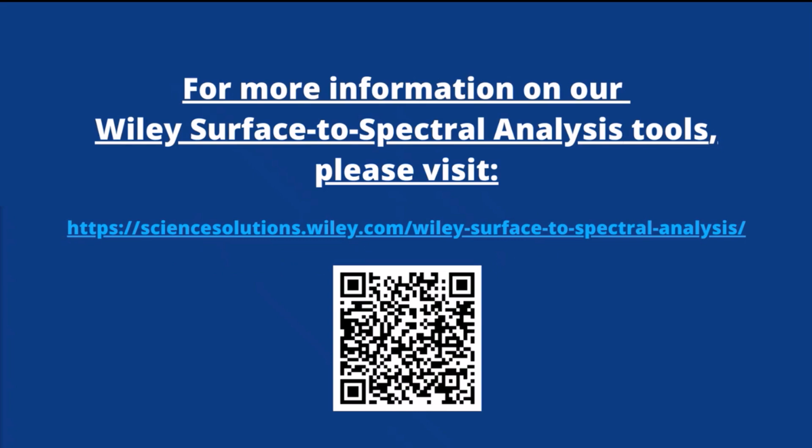Michelle, you might know a bit more about the specific spectral libraries within KnowItAll. Yeah, so if you found our library doesn't cover your area, you could create libraries of your own as you're collecting botanic materials, and then you can search against your library that way. So it's comprehensive.